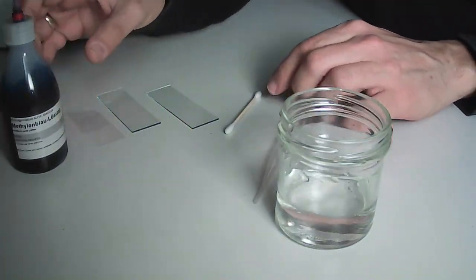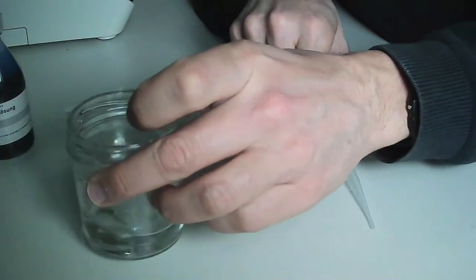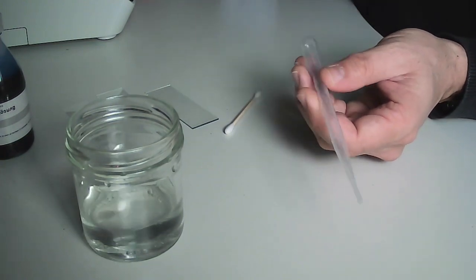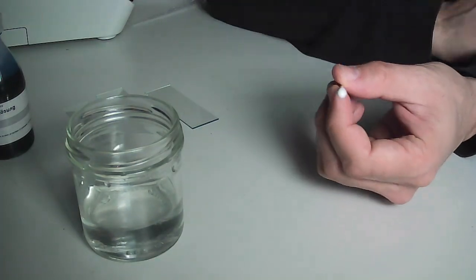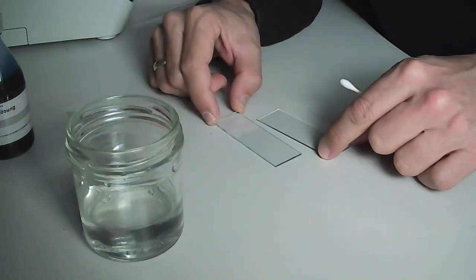Okay, here, this is basically, of course, methylene blue. You already know this. I need some tap water, a pipette. These are disposable pipettes. You can also use, I don't know, more fancy ones like these. That is really not so important. Q-tips to pick up the sample from the cheek cells, of course, microscope slides.